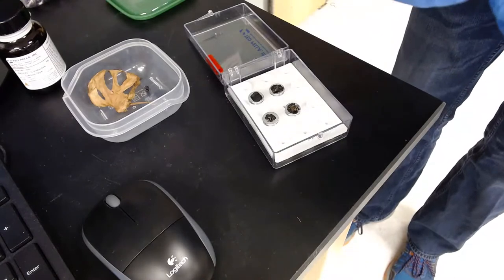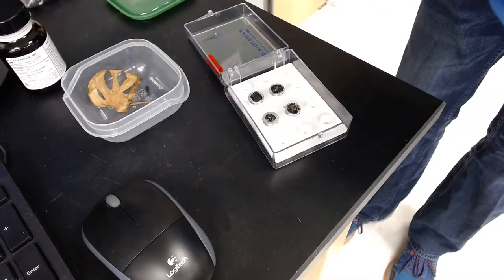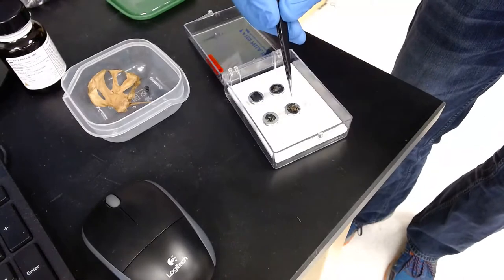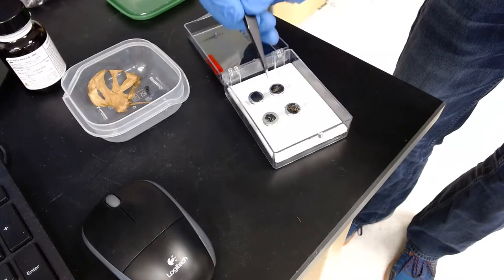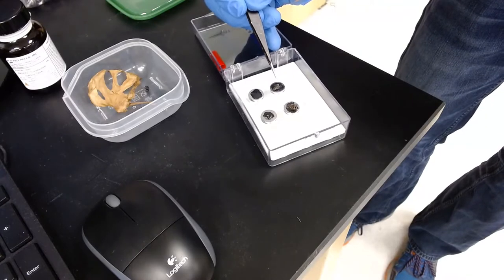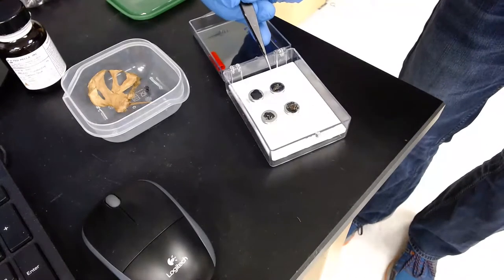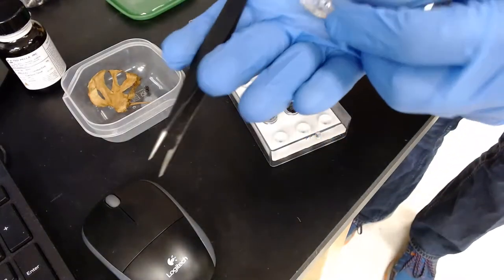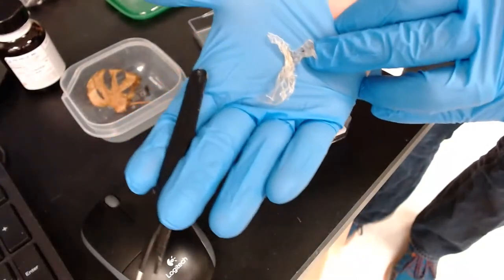So for those that are just joining us, we have Natalie here walking us through how to do electron microscopy, and we're going to prepare some very high tech samples. So this one is sample A. That's a dead spider. This is dead spider legs. This is a black fly, which is responsible for the highest amount of insect larva protein production in the world, black fly larva. You need to know this. Yes, if you want to make a black fly burger, you will use black fly larva. And then finally, we've got this wonderfully donated sample from our own cosplay Michaela. It's a snake skin. That's right.